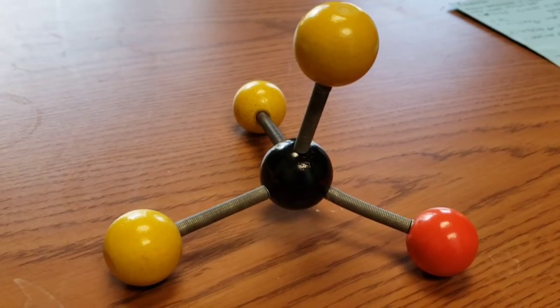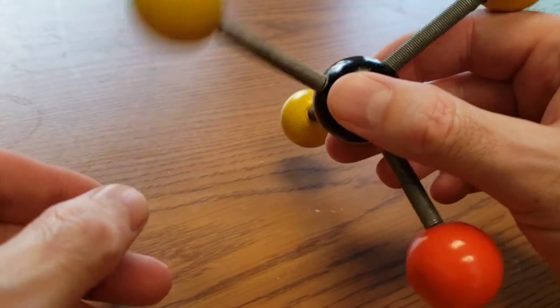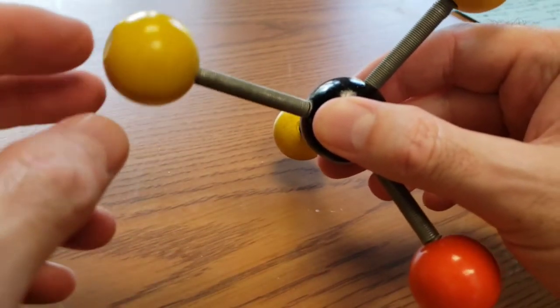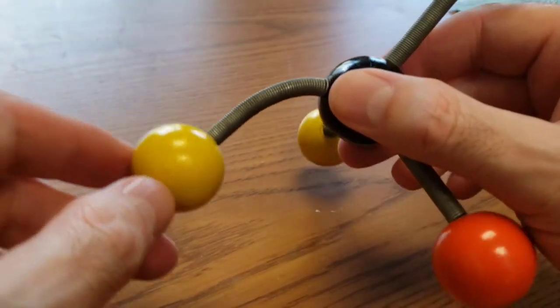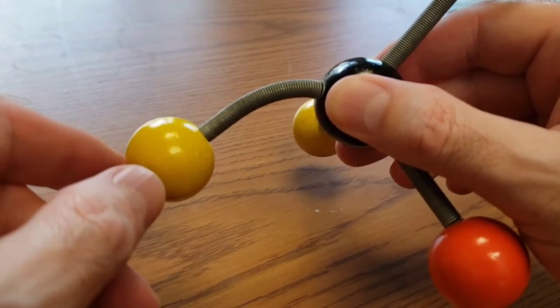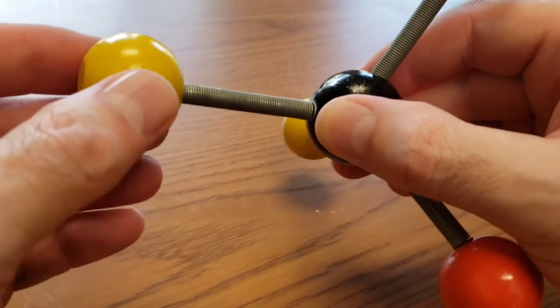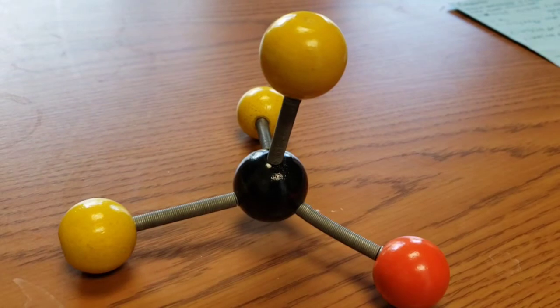When infrared radiation interacts with matter, it causes covalent bonds inside molecules to vibrate. These vibrations obey simple laws of physics, like Hooke's law of vibration, which determines what the frequency is of a spring. We're going to see modes of vibration that are bends and stretches. Only modes of vibration that change the dipole moment of the molecule are available to be seen by the infrared spectrophotometer.